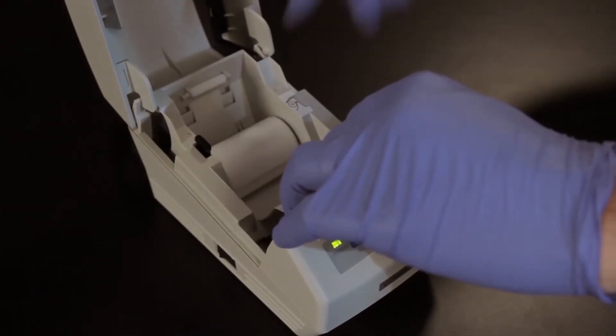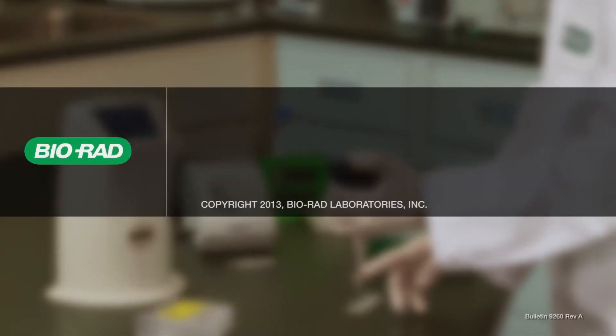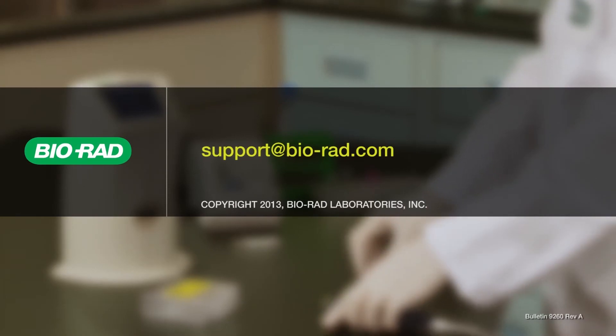Congratulations! Your cleaned printer is now all set and ready to print your next cell count. We hope this solved your problem, but if at any time you find you need help with any of your Bio-Rad products, please email us at support at Bio-Rad dot com, and we'll do our best to get you working again.